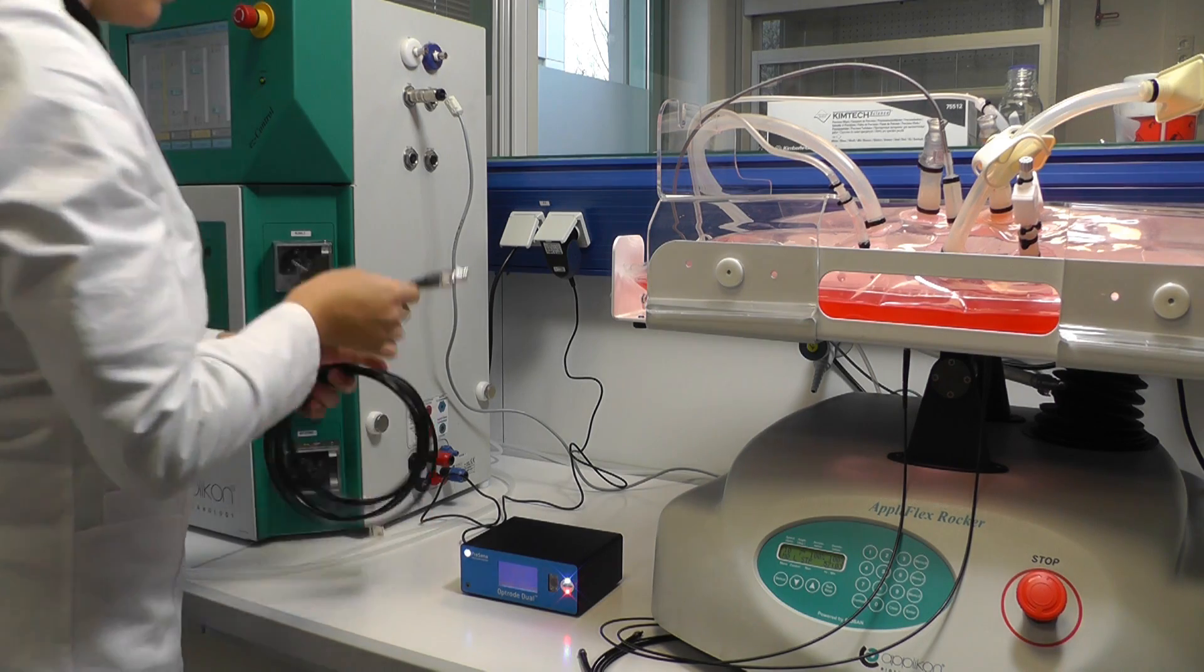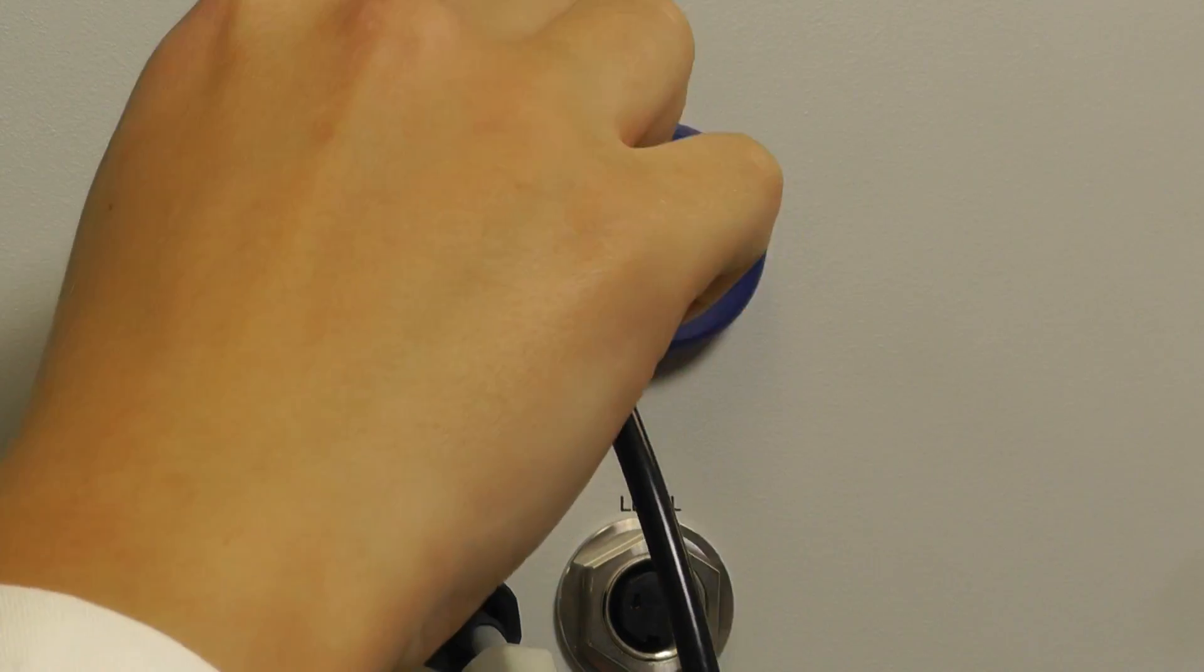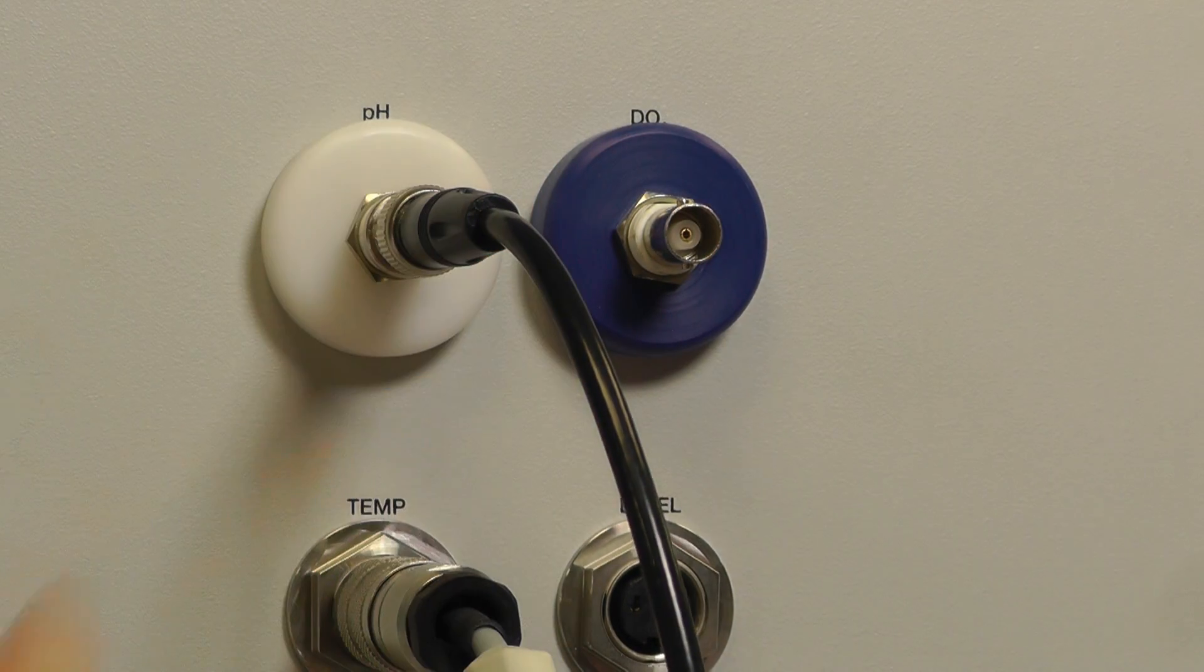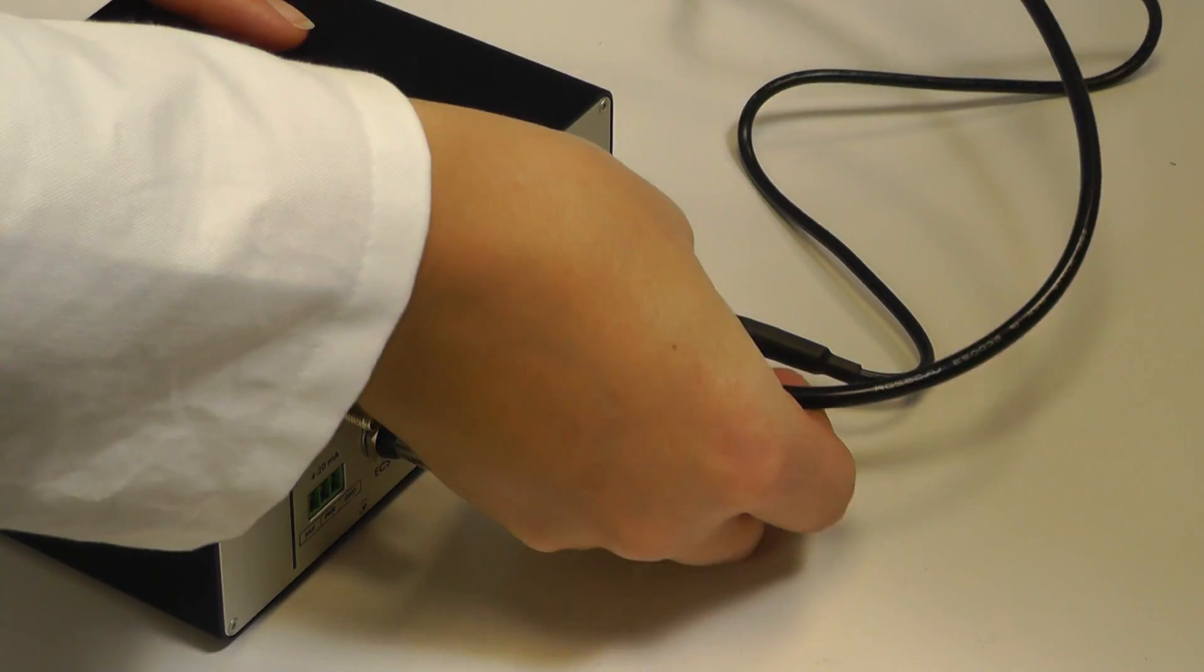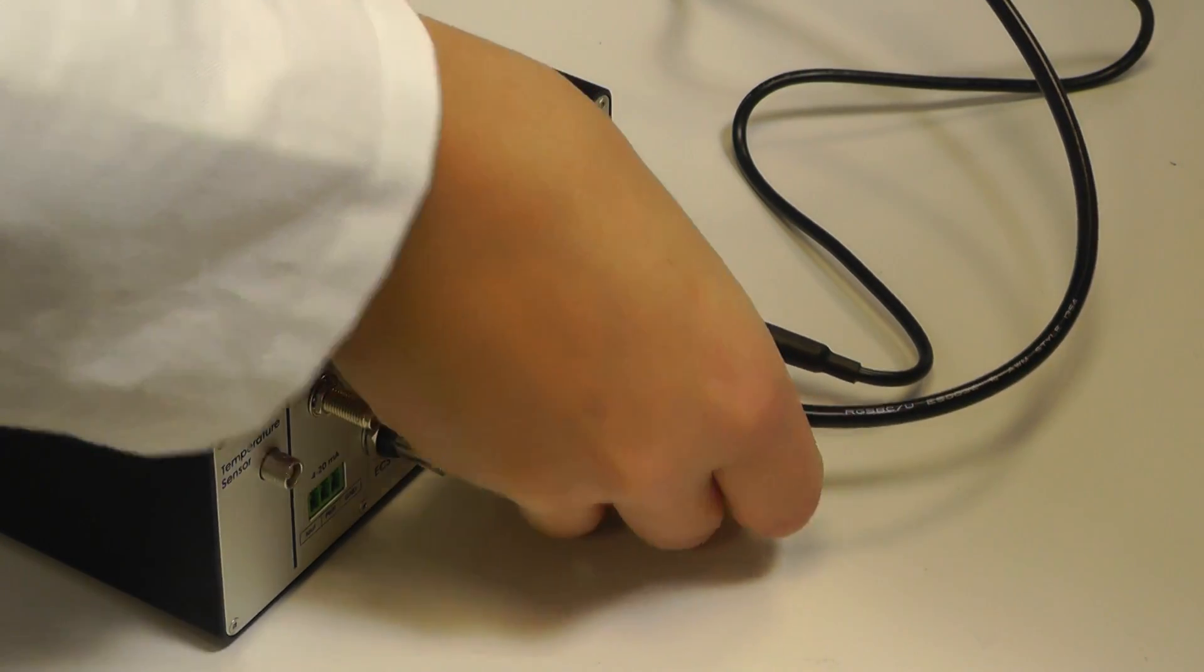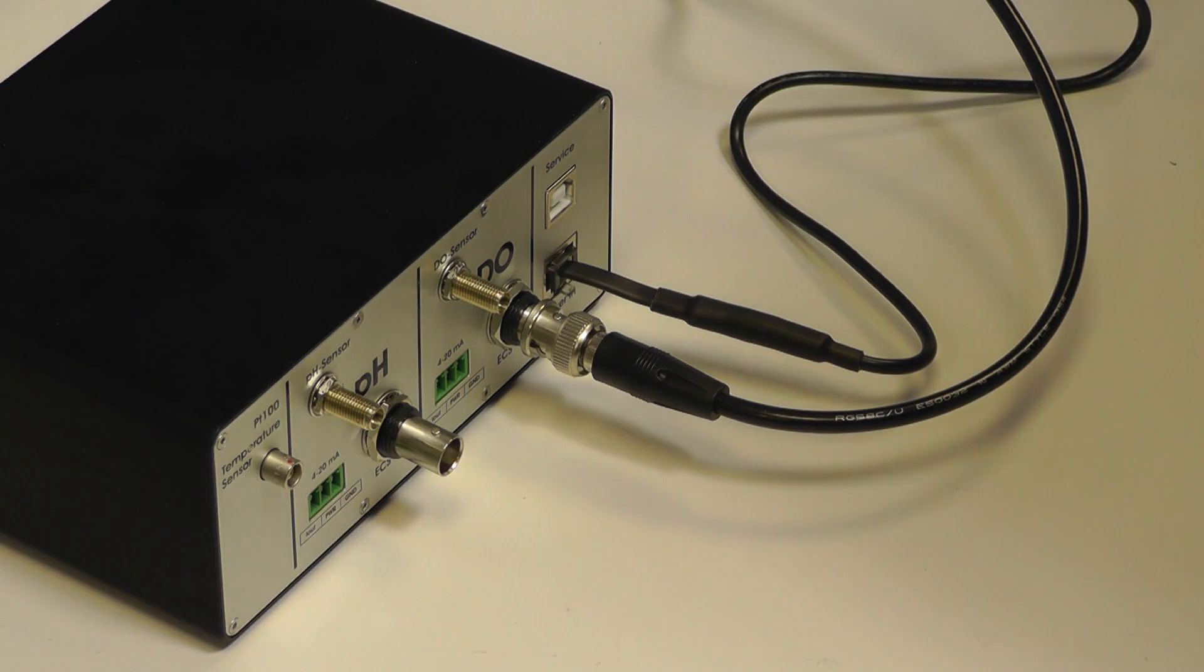For controllers having BNC connectors for DO and PH output, use the provided cables and attach them to the DO and PH input of your controller. Then connect the cables to the DO and PH output on the Optra Dual back panel respectively. Make sure you don't mix up oxygen and PH connectors.